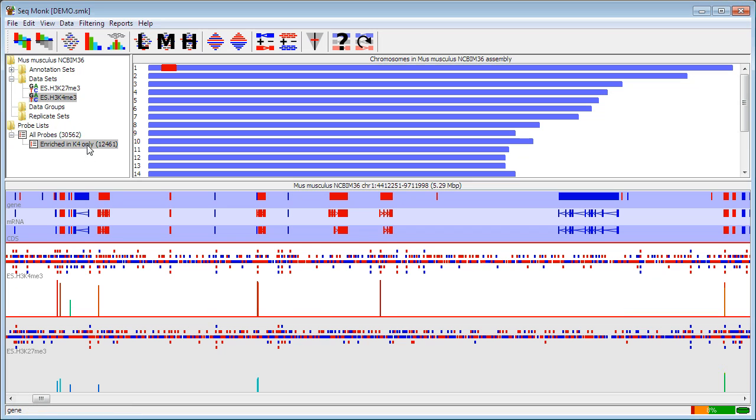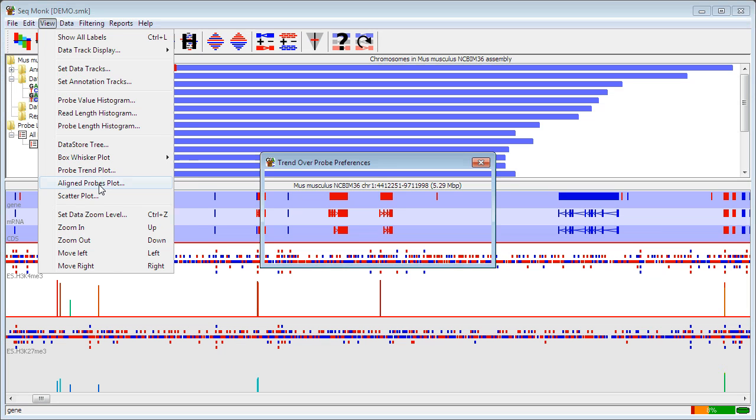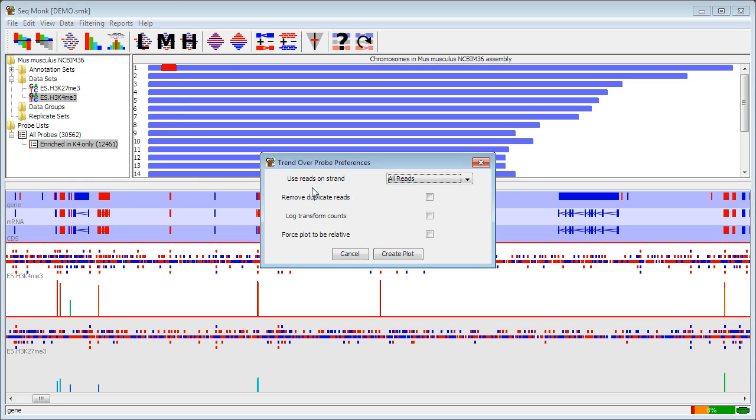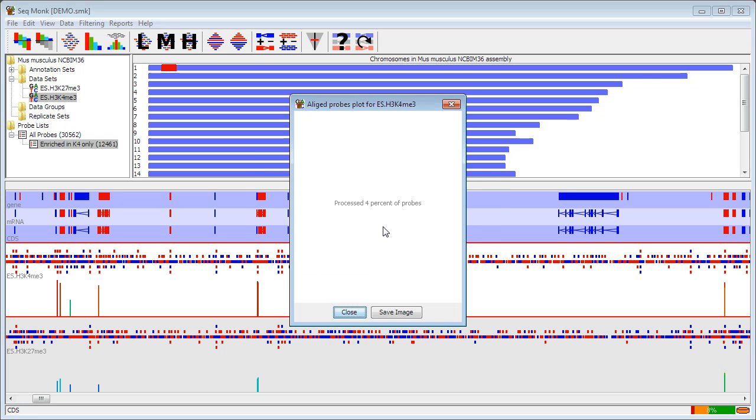Another way of looking at my data is to look at an aligned probes plot. An aligned probes plot instead of taking an averaged view like the trend plot does it allows me to look at each individual probe and it aligns them up one above the other and then uses a density plot to see what's going on. So I'm just going to create this. I have more than a thousand probes so it's only going to show me the first thousand but that should be enough to see what's going on.